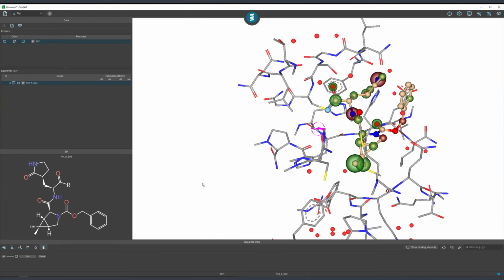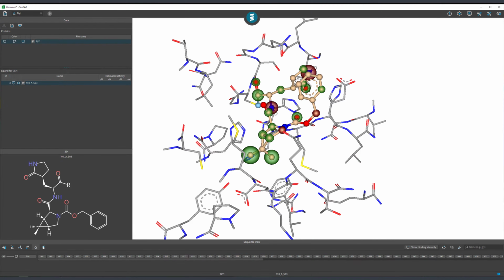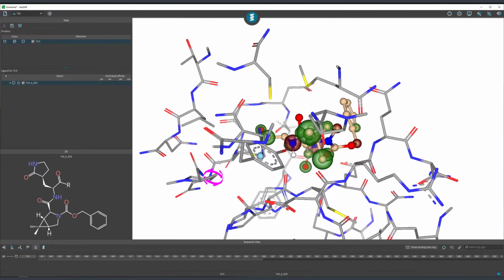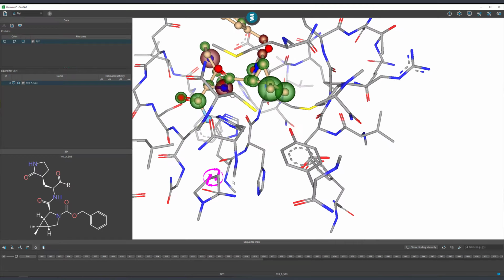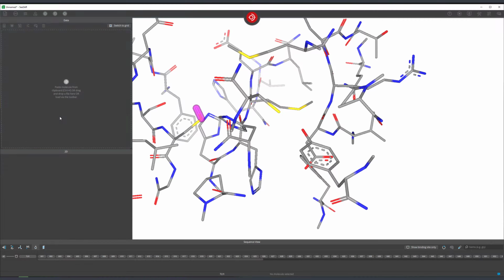So we're going to delete the secondary structural representation of chains and get rid of all of these water molecules. And now that things look much better, let's right click on the row and add to the docking mode.